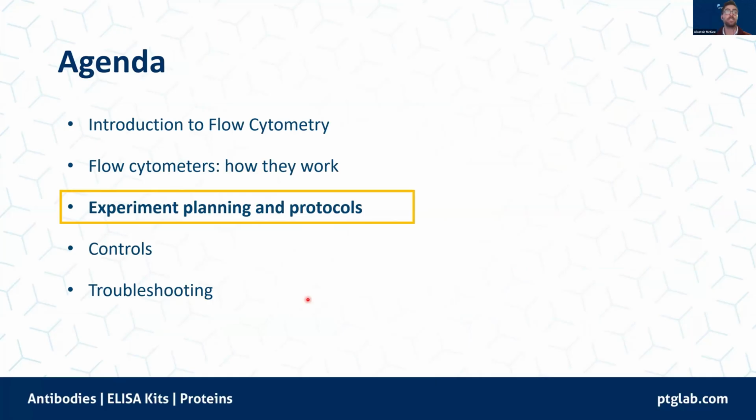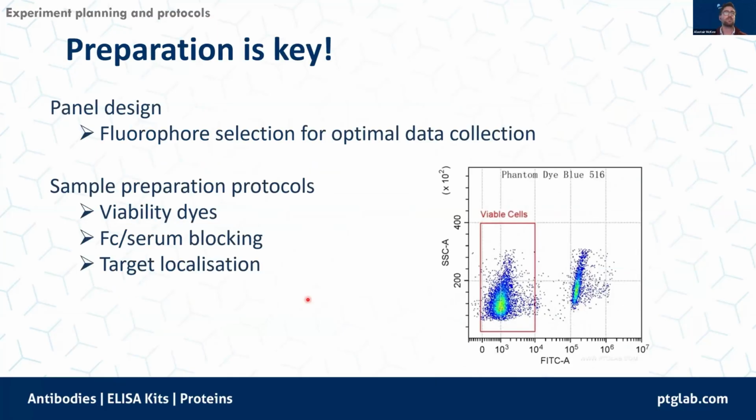Okay, so onto experimental planning protocols. In flow cytometry, preparation really is key. I said at the beginning, when you're planning your experiments, this is the area you should spend the most time on, particularly when you're working with larger flow cytometry panels.